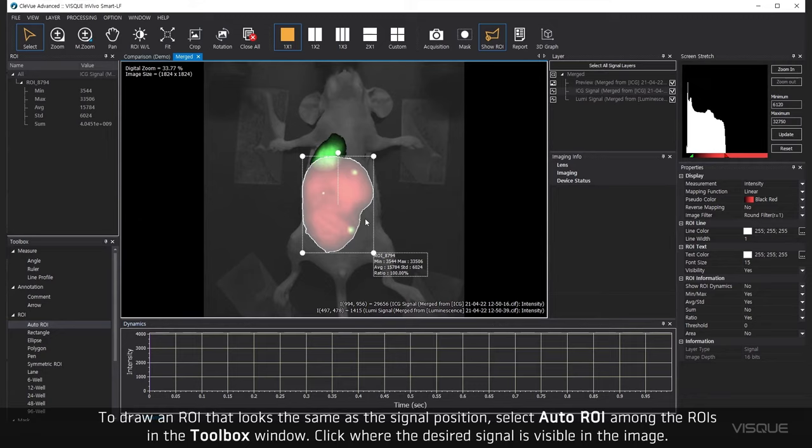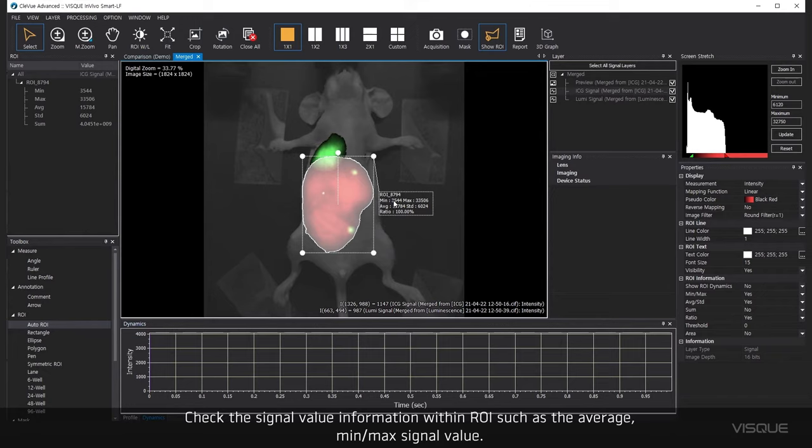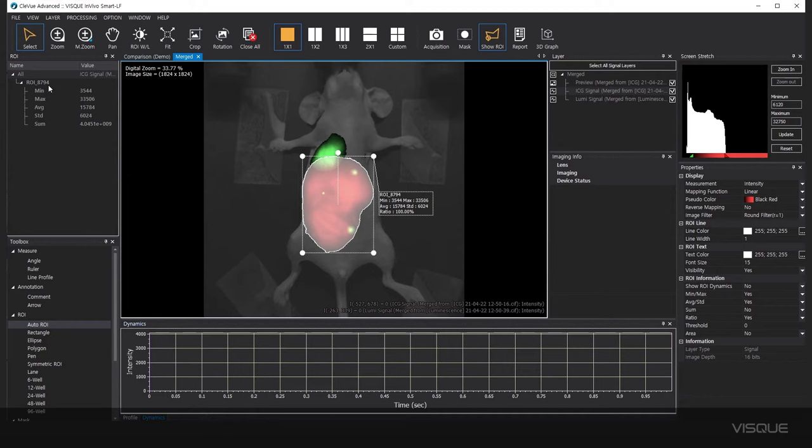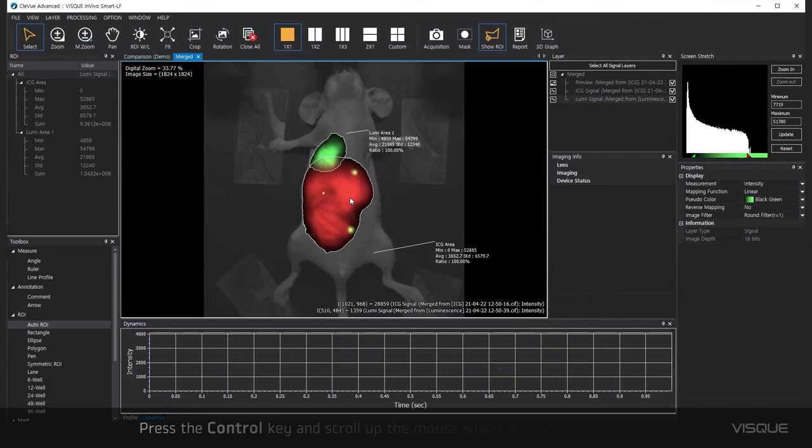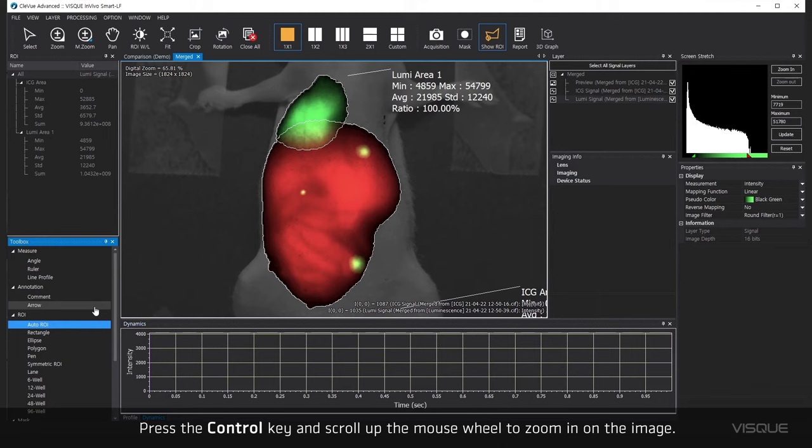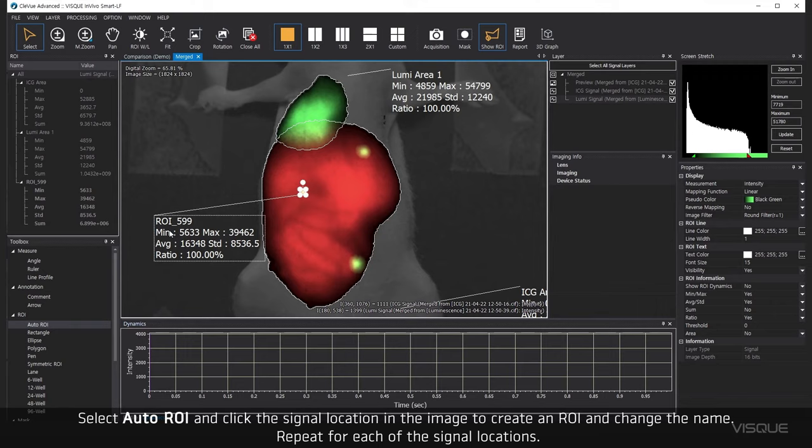Check the signal value information with an ROI, such as the average, minimum, or maximum signal value. To change the name, double-click the ROI name in the ROI panel. Press the Ctrl key and scroll up the mouse wheel to zoom in on the image. Select Auto ROI and click the signal location in the image to create an ROI and change the name. Repeat for each of the signal locations.